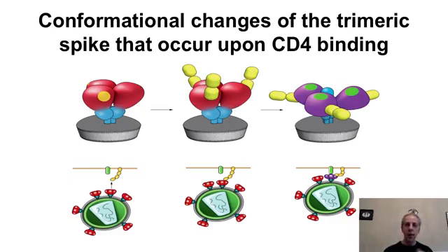And then the interaction starts, and they ask you more image processing questions, and then you try to address that. And that's what we illustrate here with a schematic: there is a change in shape, a change in conformation when there is CD4 binding. And that's what we illustrate here with this change in the arms, kind of an opening. And you can see this with image processing. You couldn't see that with your naked eye. This is one of the really exciting areas where image processing actually helps you see something you couldn't see before.